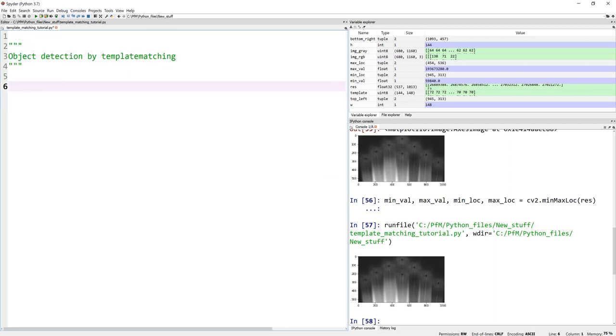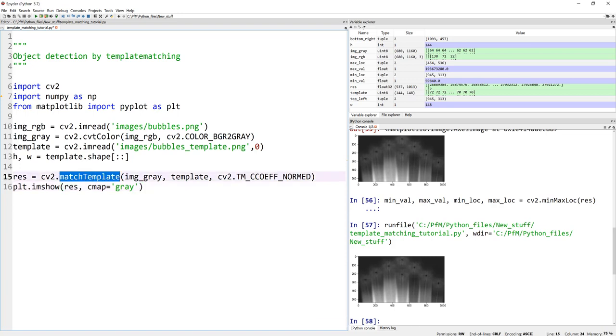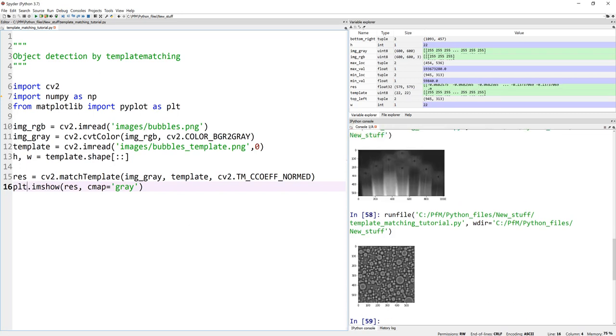And in this case, I was thinking if let me copy and paste up to the point where it makes sense. And then I'll explain pretty much the same thing. This time, I'm reading an image called bubbles.png. Again, these are like, let's say, this could be a microscope image. And I have a template of a small bubble that I actually am reading. Again, my height and width, I'm reading them here.